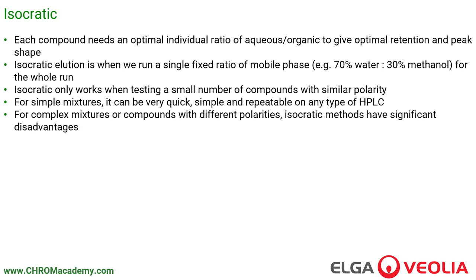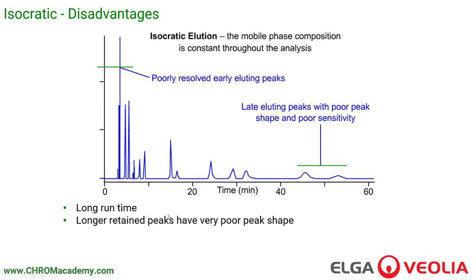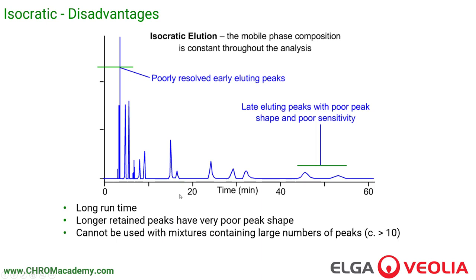However, for complex mixtures or compounds with different polarities, isocratic methods have significant disadvantages. One disadvantage is very long run times — analysis can take an hour to get substances out. We also get poor resolution and poor separation of early peaks. Peaks that don't spend long in the column will not be well separated, while other substances eluting very late stick in the column too long, spreading out and giving very poor peak shape and poor sensitivity. We end up with long run times, poor peak shape for long-retaining peaks, and we really can't use isocratic with mixtures containing large numbers of substances — probably more than 10 peaks. Contamination also builds up in the column, as the mobile phase isn't strong enough to elute substances with very high affinity for the stationary phase.